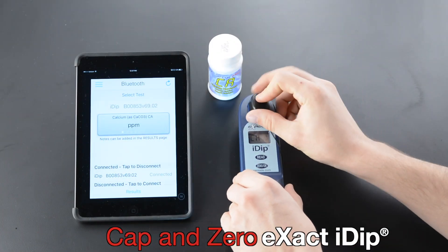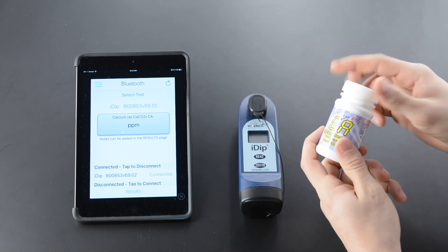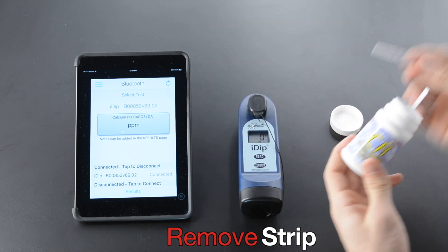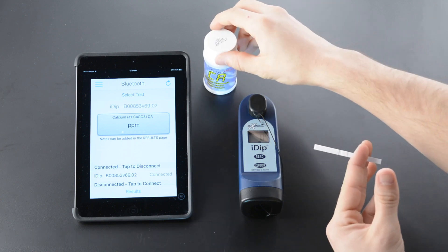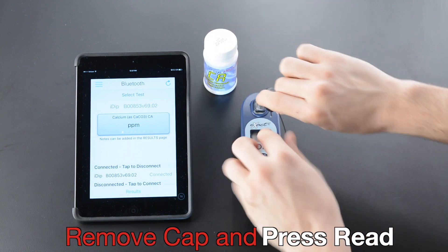Select Test. Cap and zero XactiDip. Remove strip, then replace lid on bottle.